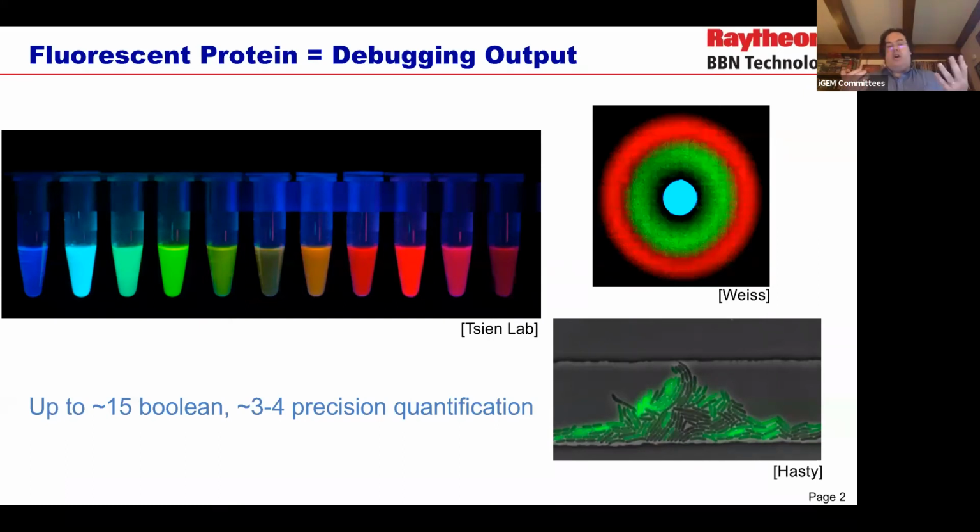If you just want to know what are the possible fluorescences, what plus minus, is a marker here or not, you can get up to around 15 or so different fluorescent proteins measured at the same time. But they tend to slop over into one another's channels a lot. So in practice, if we want to do precision quantification, which is often the case, we can use really only about 3 or 4 fluorescent proteins as probes at a time. Generally, essentially a blue, a green/yellow, a red, and something over in the deep red infrared range.